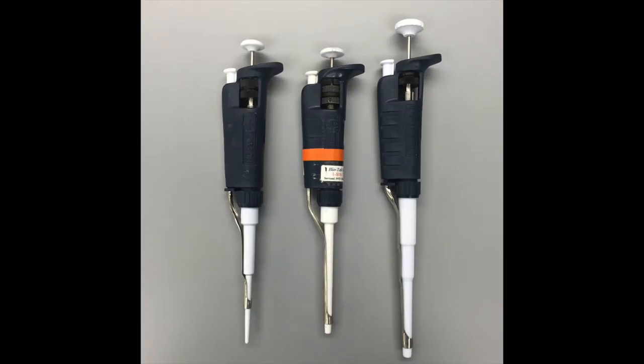First, we will start by explaining the parts of the instrument. This is the control button used for drawing up and ejecting the liquid. The volume adjustment allows you to specify how much liquid you want to draw. The ejector is used to remove the tip when you are finished. We will demonstrate this later in the video.